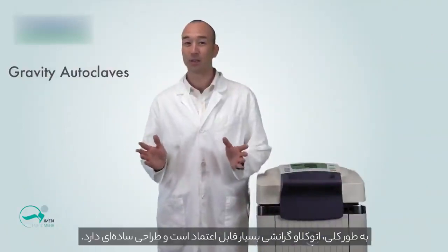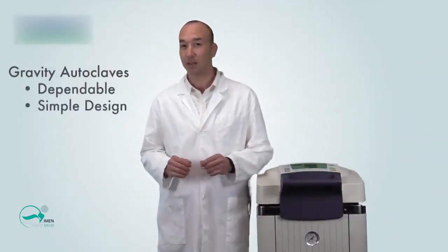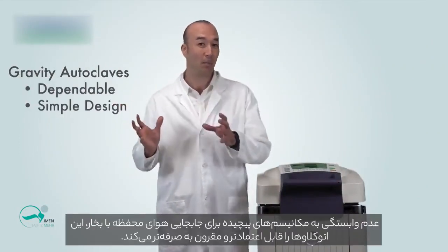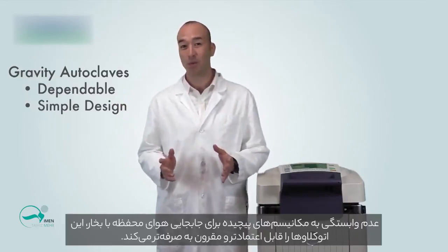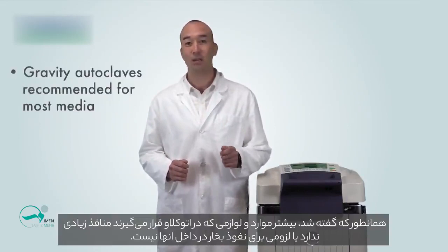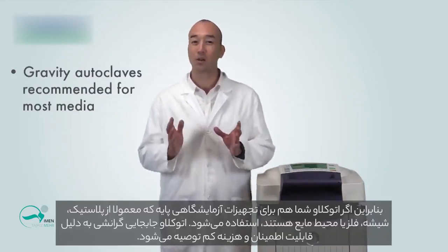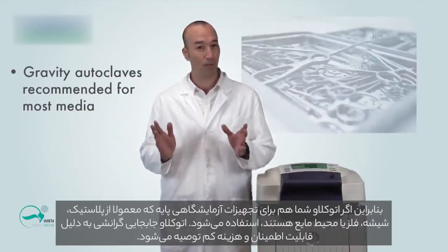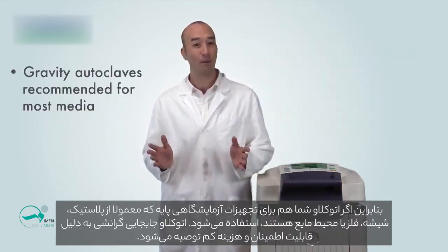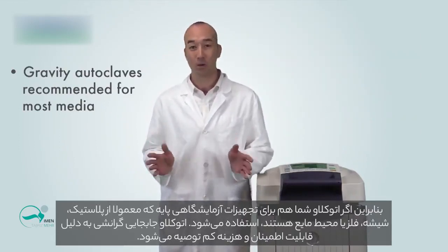Overall, gravity autoclaving is highly dependable and advantageous in the simplicity of its design. The lack of dependency on complex mechanisms to displace ambient air with steam makes these autoclaves more dependable and affordable as well. As mentioned, most autoclave media do not contain spaces or obstacles for steam to penetrate within, so if you're autoclaving basic laboratory equipment made from metals, glass, plastic, or liquid media, the basic gravity displacement autoclave is the recommended type due to its reliability and low cost.